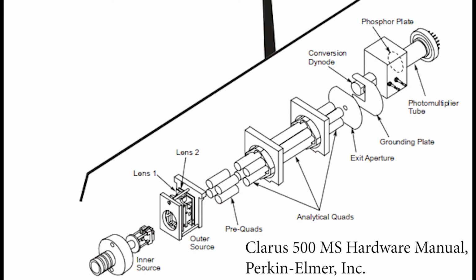Not the glasses or optics that we're used to, which form light beams and focus light. We're not trying to focus light, we're trying to focus ions. Because we're still trying to focus things, we call them optics. But they're typically just metal plates that we apply voltages to.